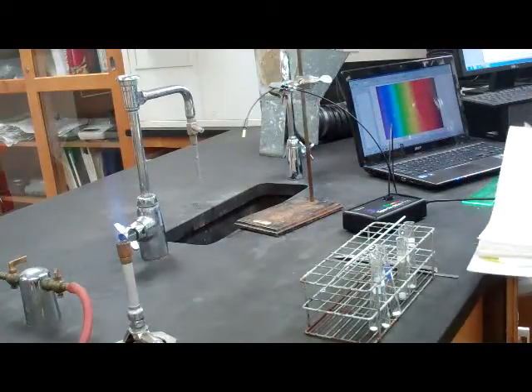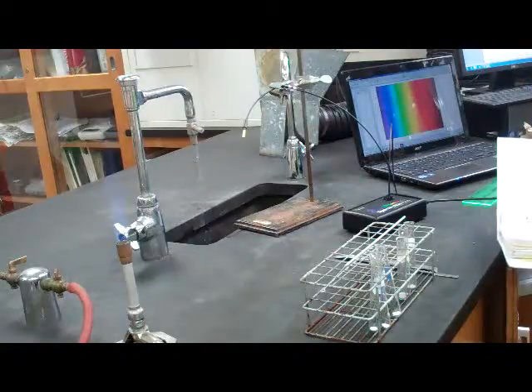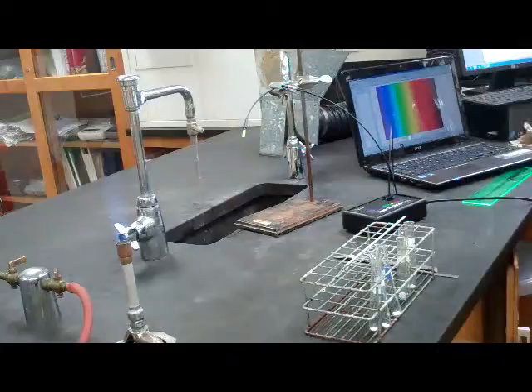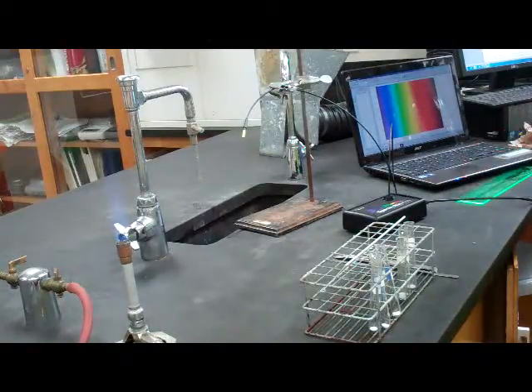Okay, so there we go with intensity. Now that I have the spectrum, which you notice has changed a bit from our original screen, we're going to click Collect on the computer, the green arrow up on the top.